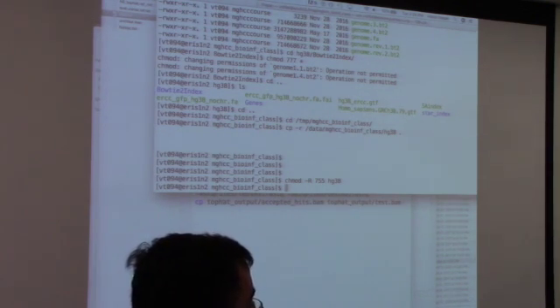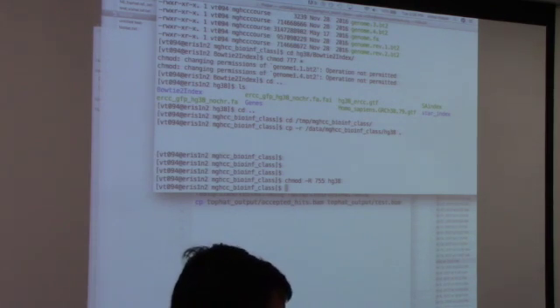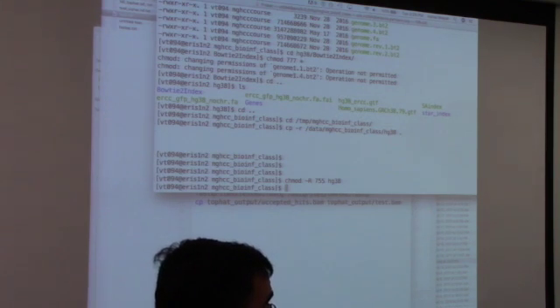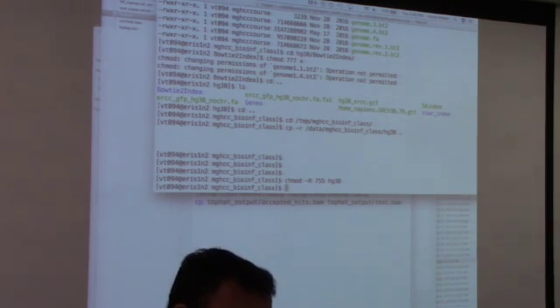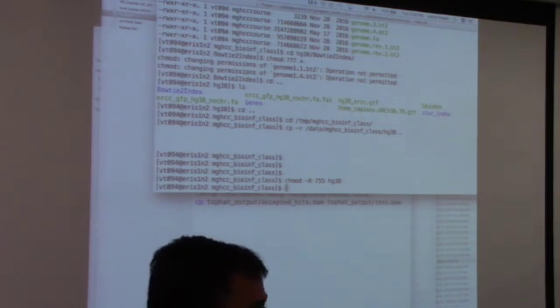If you change the whole directory outside, it only changes that directory. If there's anything inside it that's not permissioned, it will only copy the stuff that was already permissioned in that directory. Alright, so this should take about 2-3 minutes.